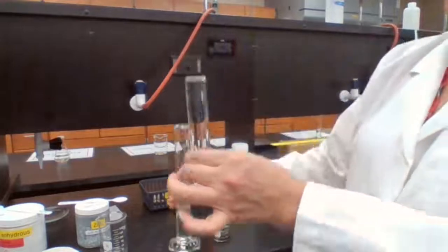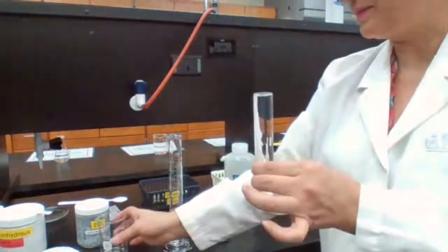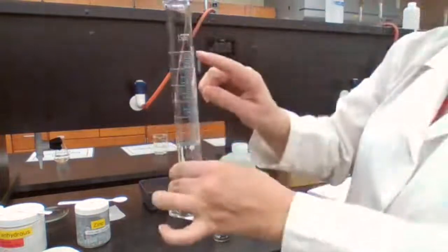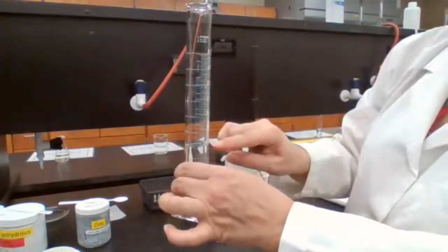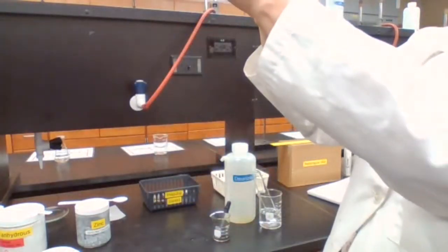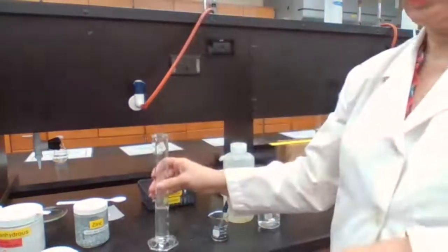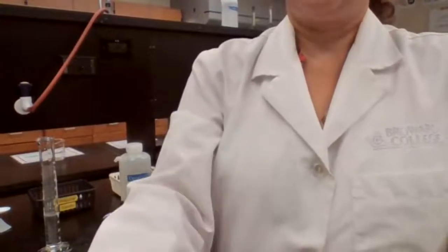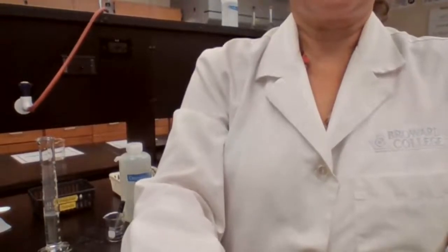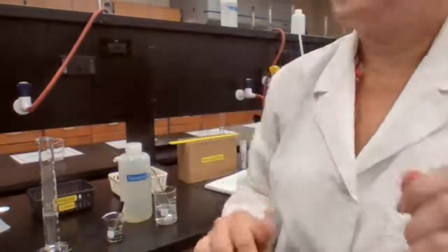Okay, filled up. How much water did I use for this? I started with 100 and I ended up with 40.5. So 100.0 minus 40.5 equals the volume of the test tube. Whatever number you find there, that would be the volume for the test tube.